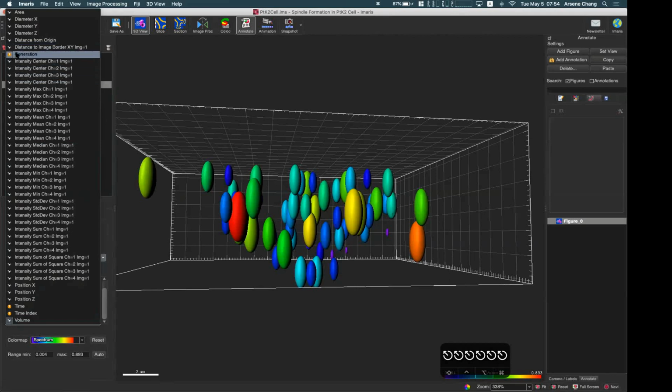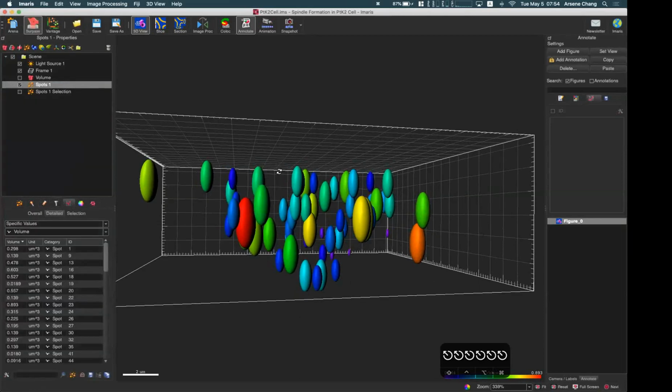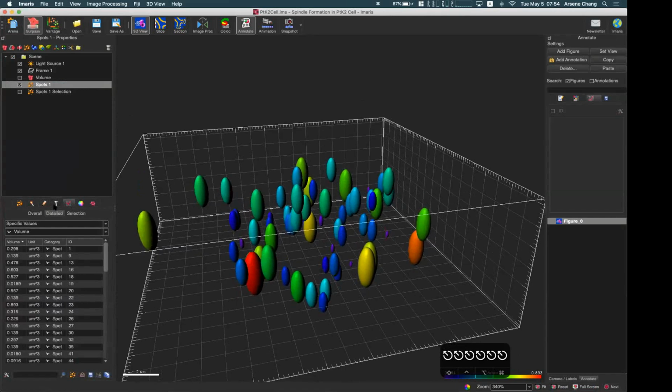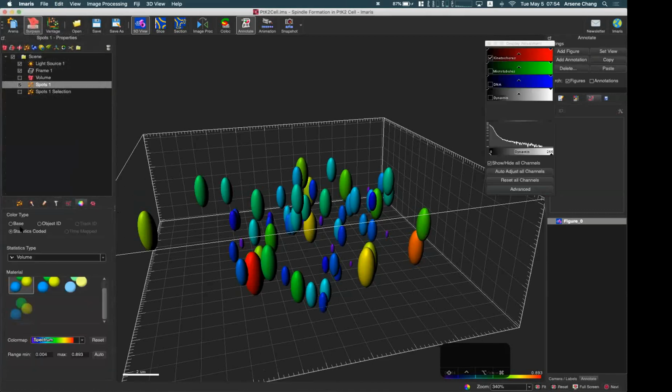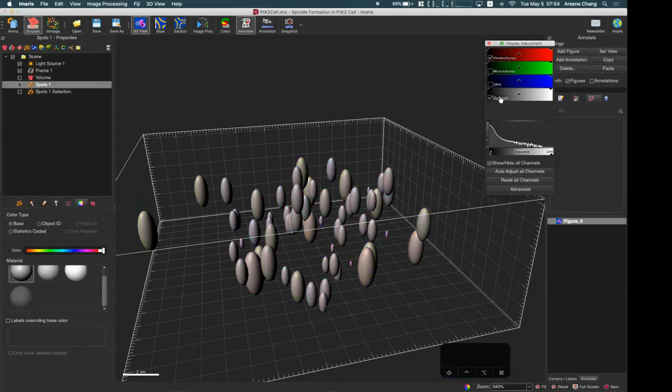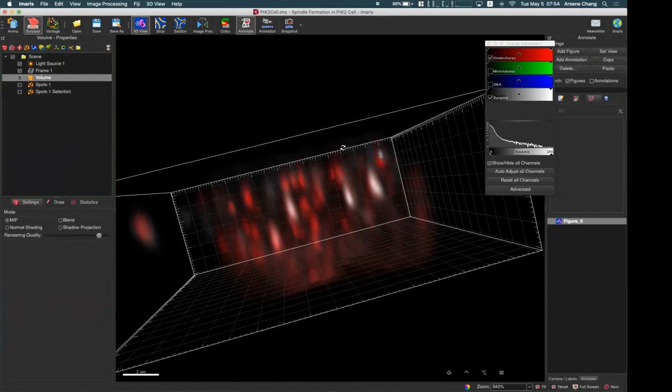There's no difference, so there is no meaning to do the color coding for this statistic, but for the others, it will be different. Okay, so one of the useful applications using the spot I will introduce briefly is using the intensity. As you can see, we also have the other color, white color, on the screen, which is another protein or another component.